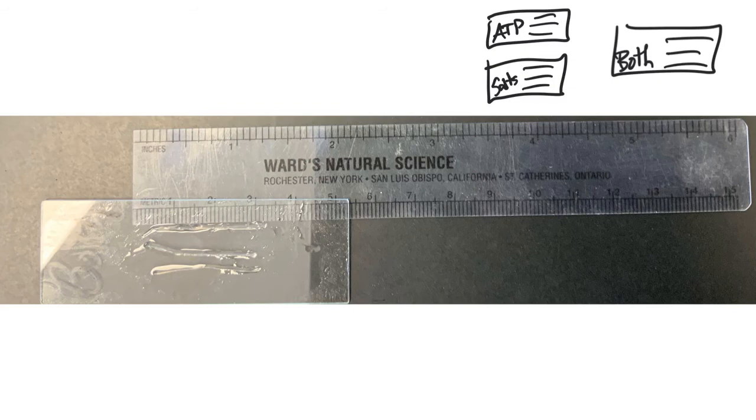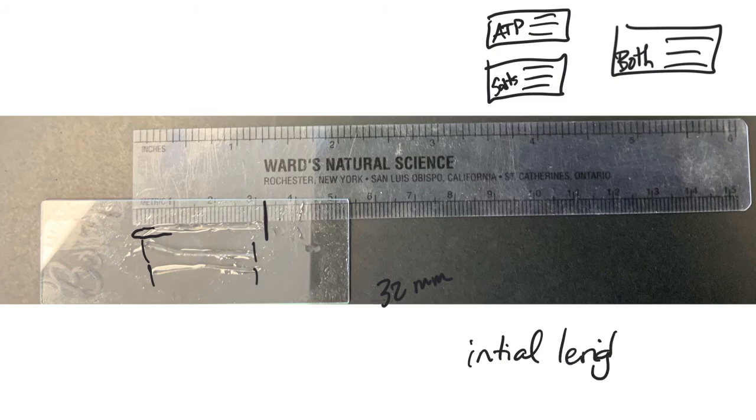So this fiber actually was here, so it was even. So I would have measured this to be 32 millimeters long. Okay, so that would have been fiber 1, and then I would measure this one, and then I would measure the length of that one. So that would have given me my starting or initial length. Okay, so this, you can't really see, but this says both, and then I would have done it for the ATP slide and the salt slide.